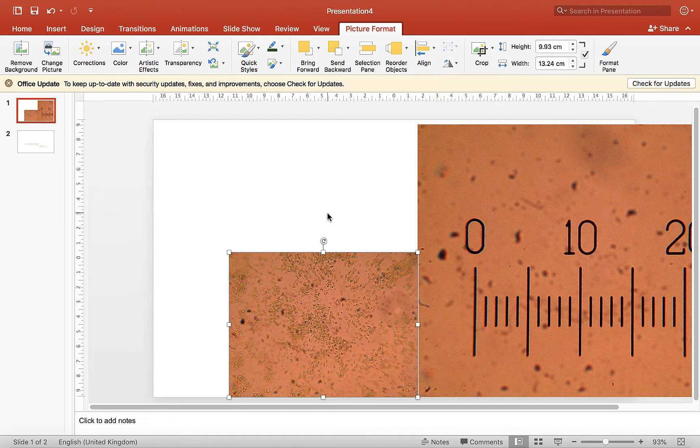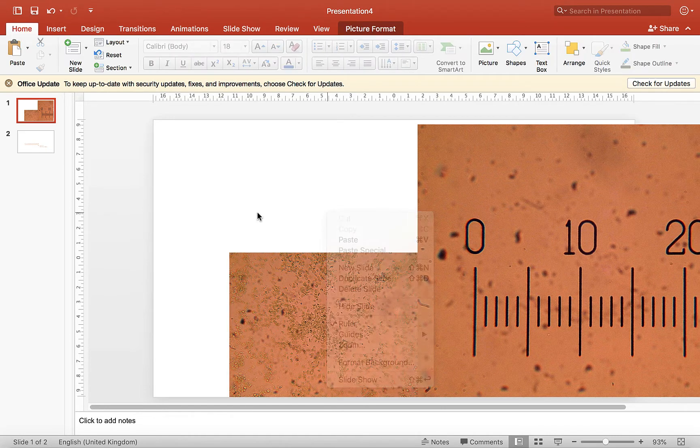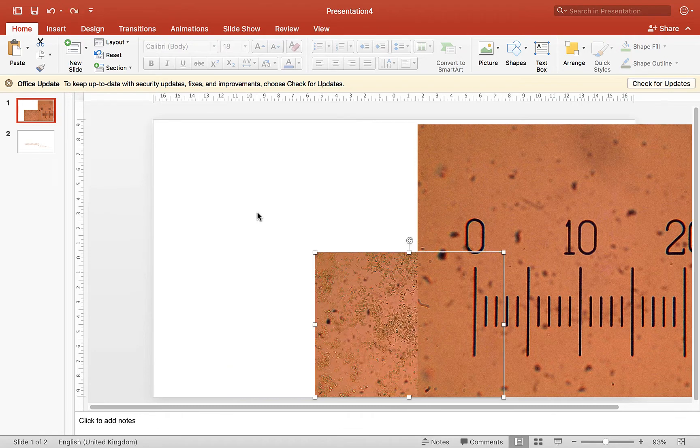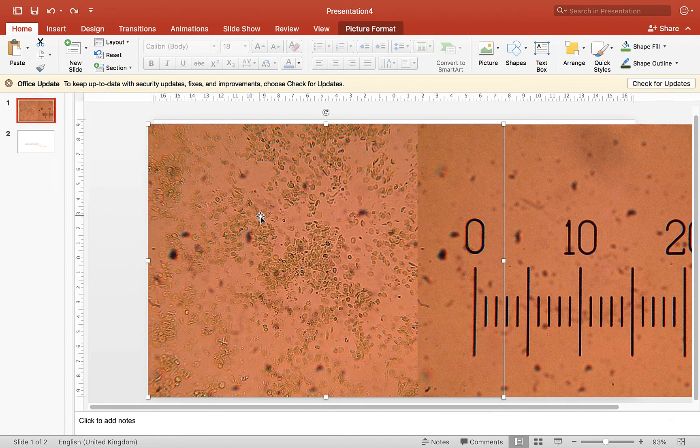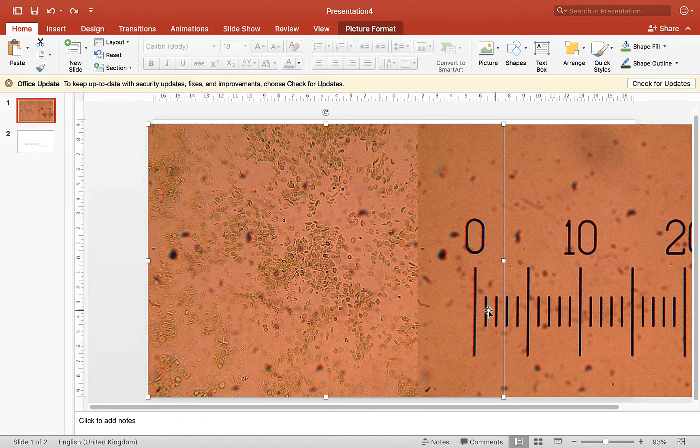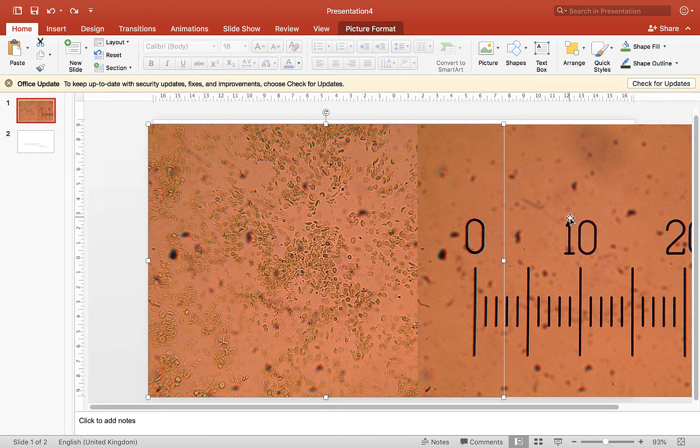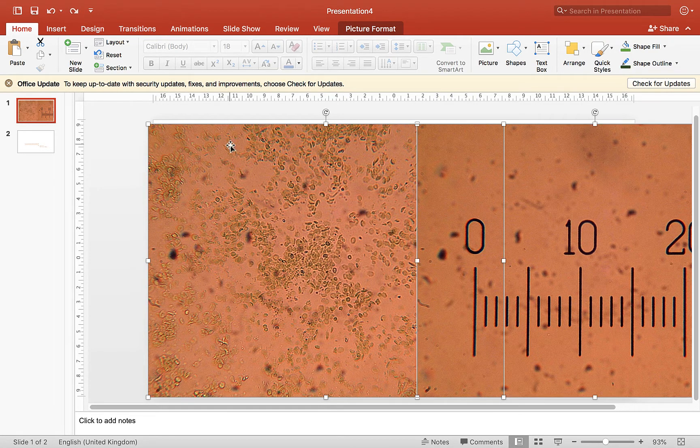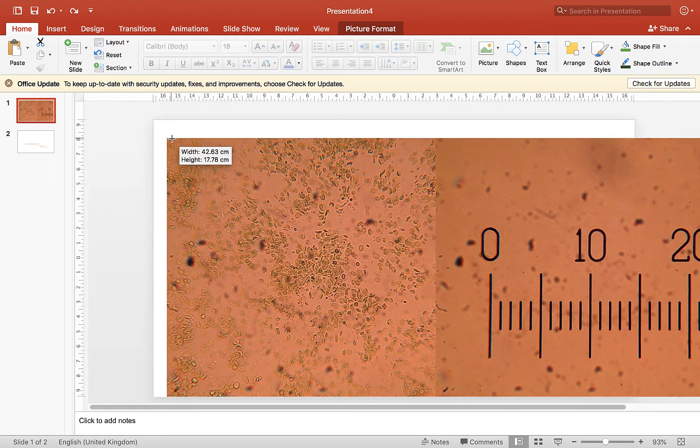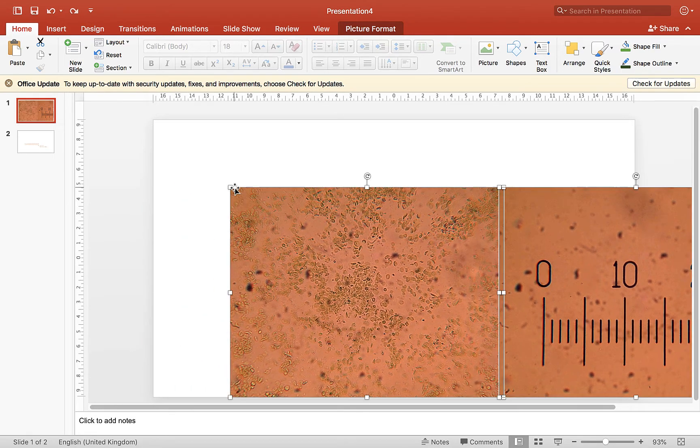So if you're going to resize anything, just get back to its original size, you need to grab both images together and scale them both together.